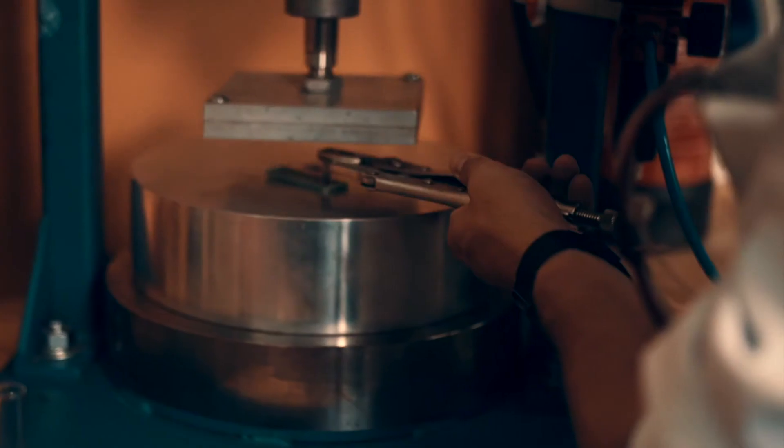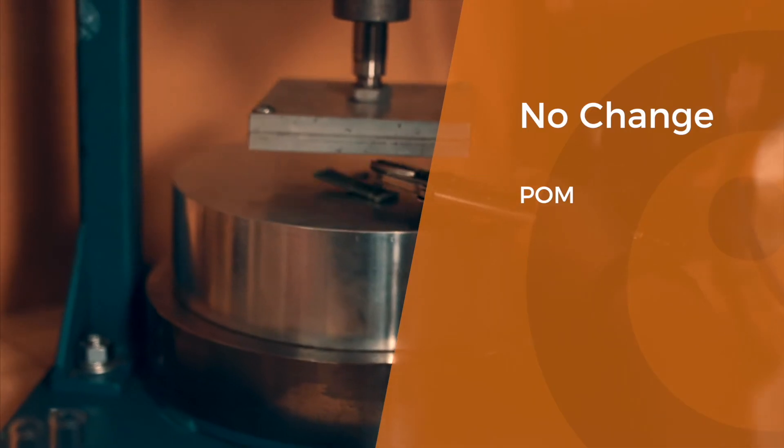Is the plastic resilient or does it show no change at all? Then it's probably POM which is able to recover its own shape.